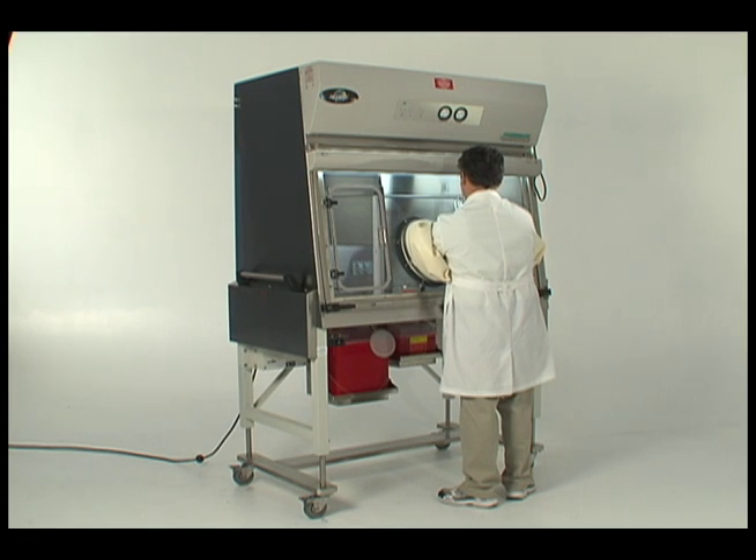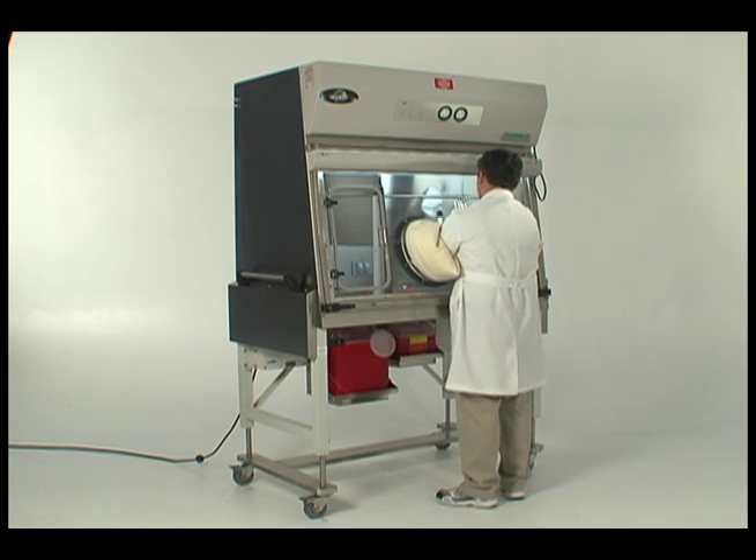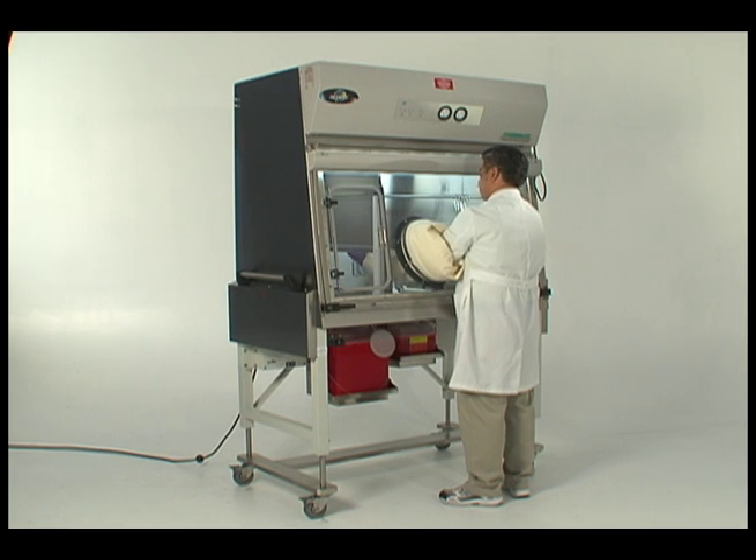Cleaning: All residues or soils from previous runs must be removed to prevent contamination of future runs. A detergent or cleaning agent must be chosen based on the type of residue remaining and the characteristics of the product.